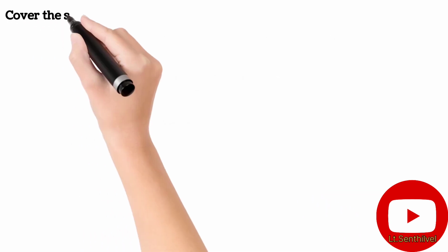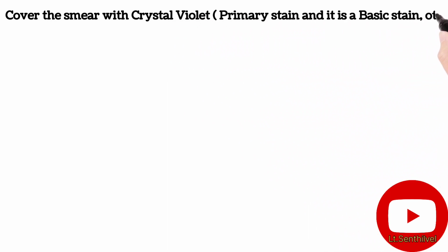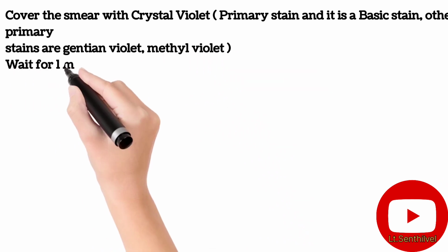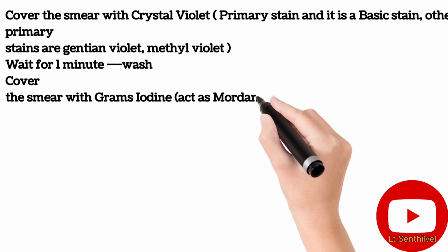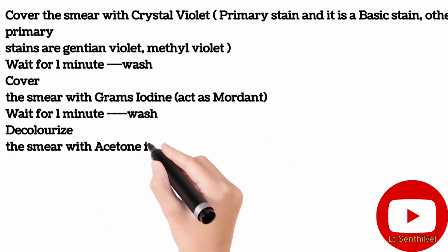Cover the smear with crystal violet, the primary stain, and it is a basic stain. Other primary stains are gentian violet and methyl violet. Wait for 1 minute. Wash. Cover the smear with Gram's iodine, which acts as mordant. Wait for 1 minute. Wash.